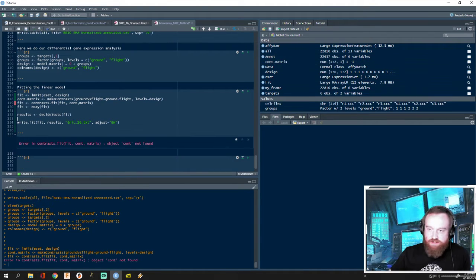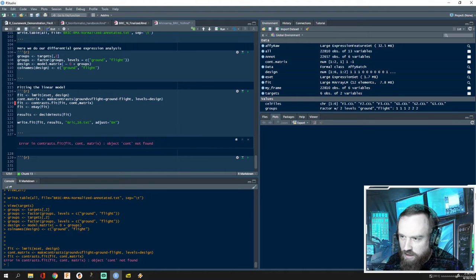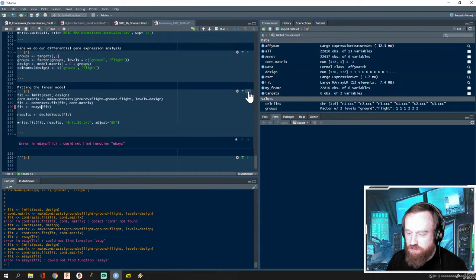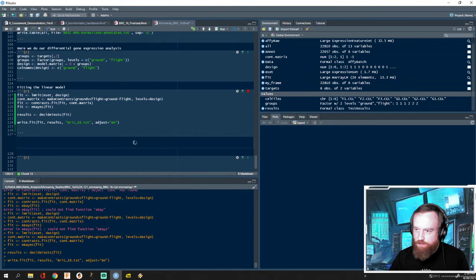All right, I'm going to run these. Uh-oh. That should be a period, I believe. Let's try this again. What am I misspelling? Because it's always got to be a misspelling. B-E-Y? Is that what it is? No, B-A-Y-E-S. Let's try it again. There we go. All right, so we're writing our fit.